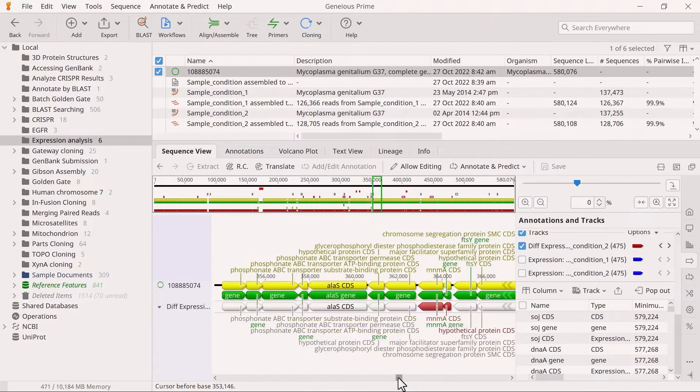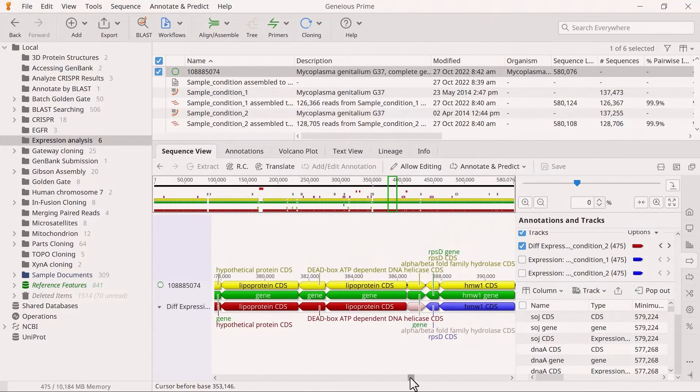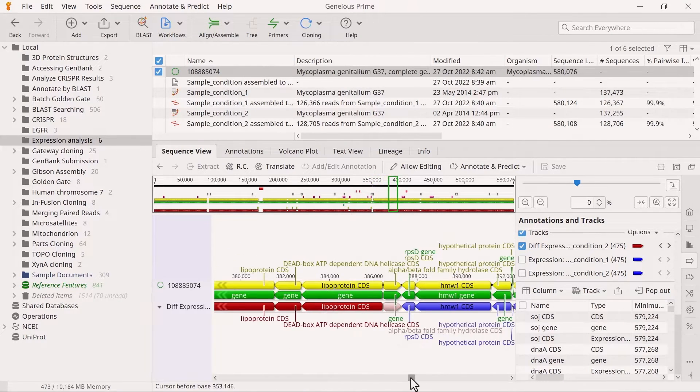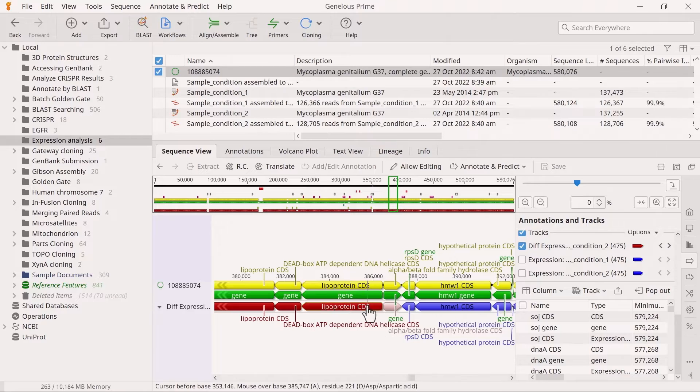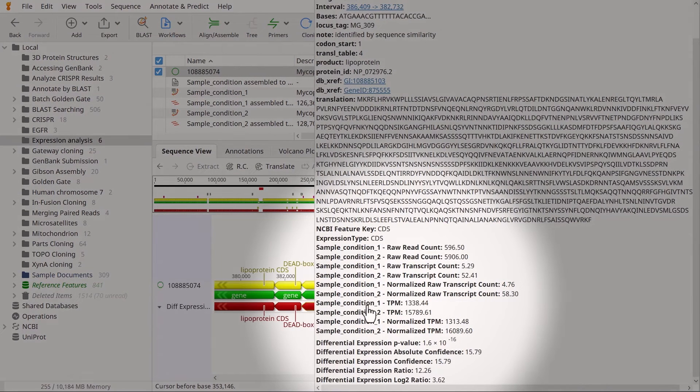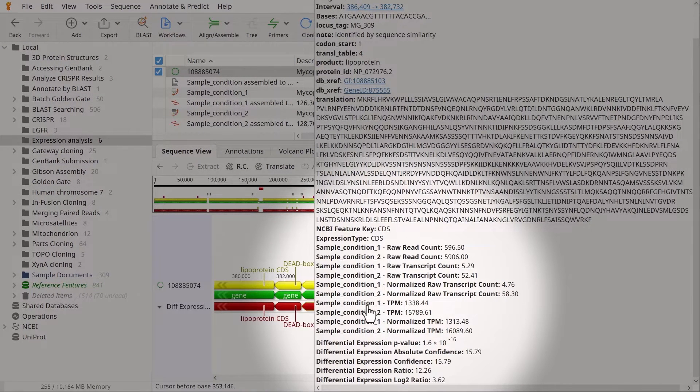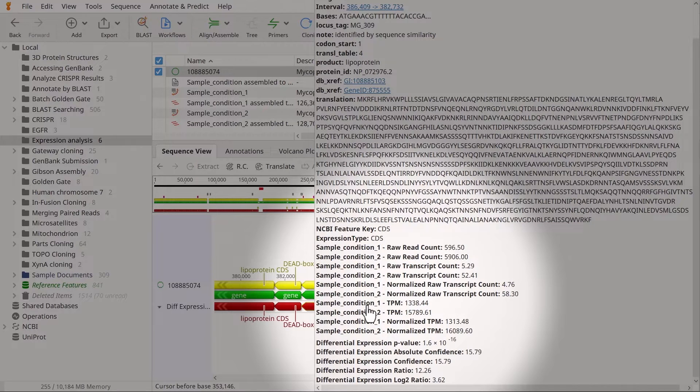If you mouse scroll over a gene, the pop-up will display data, including the raw read and transcript counts for each sample condition, plus a list of differential expression scores such as the p-value.